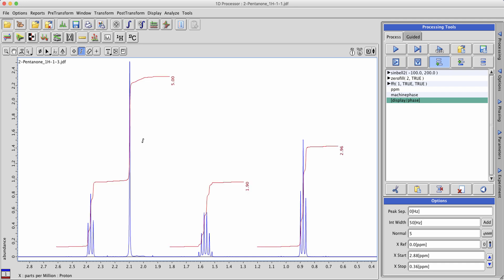Note that once integrals are defined and you save your data, those integrals will persist for future use.